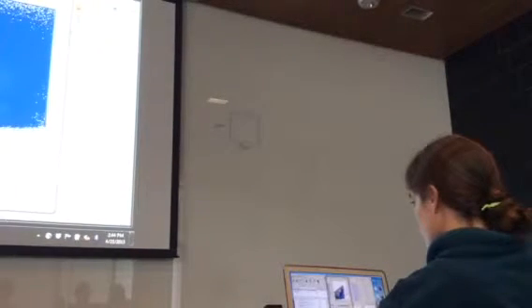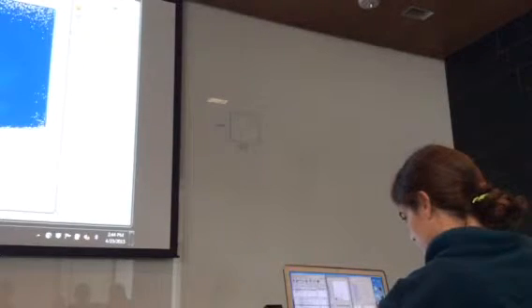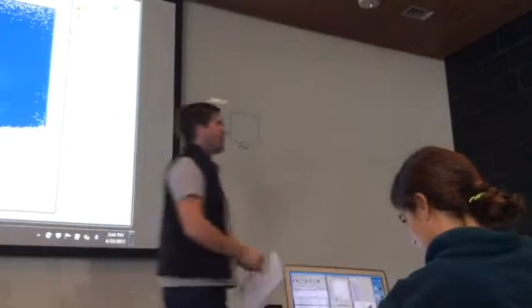Yes? Stupid question. There's no stupid questions, no stupid answers. What is the difference? Like, what do they measure? Like, what's the difference in the measure between forward and side scatter?